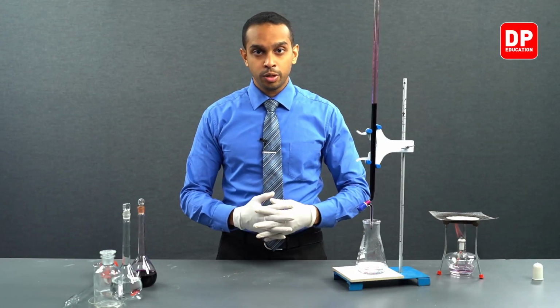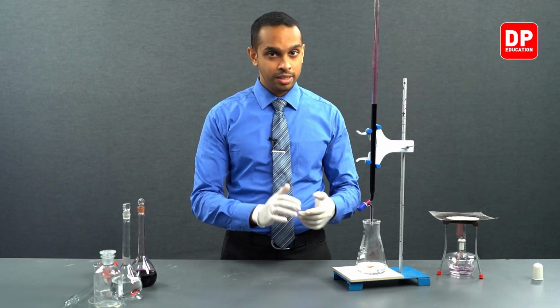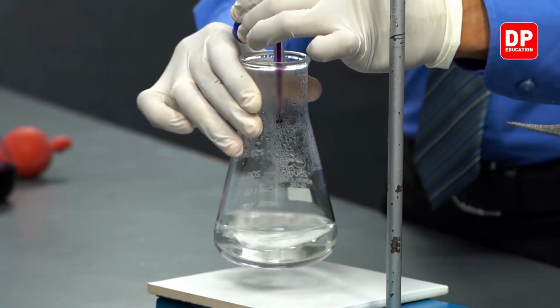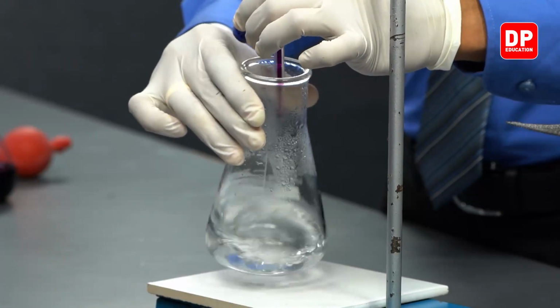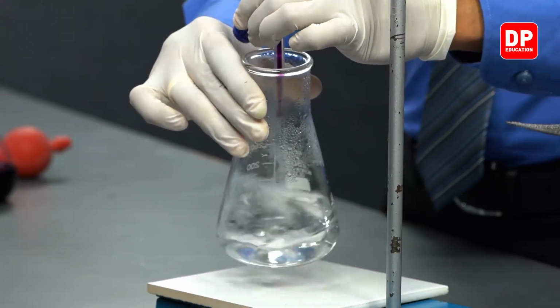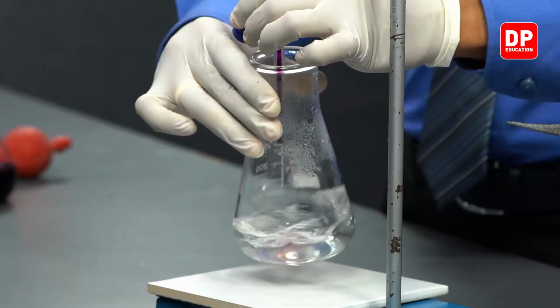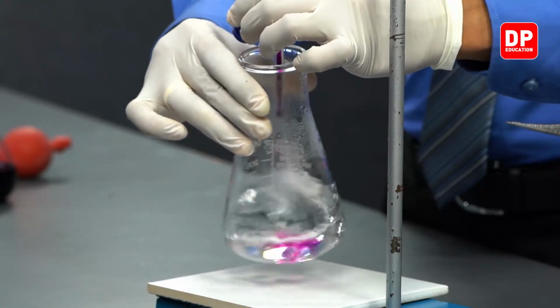Students, now I have added about 26 cubic centimeters of potassium permanganate into this solution. Let's start adding potassium permanganate little by little. We are now at 30 cubic centimeters. So you can start adding potassium permanganate drop by drop to clearly identify the end point of this titration.